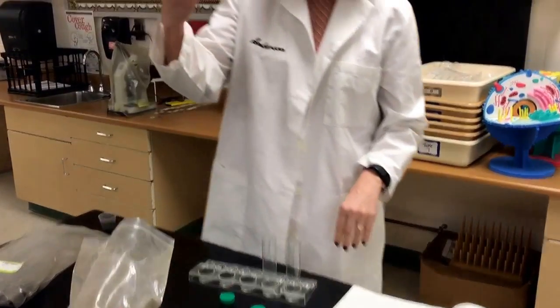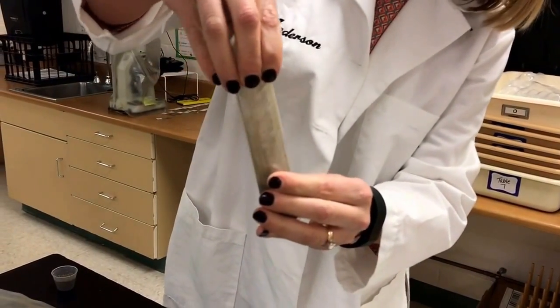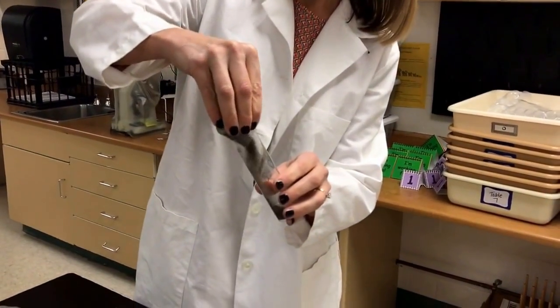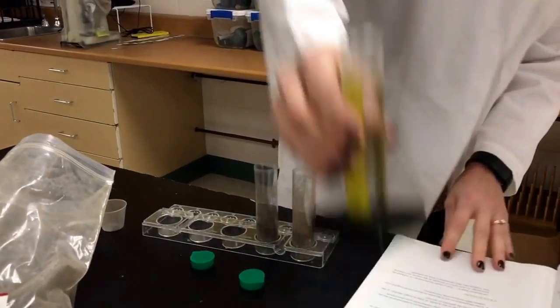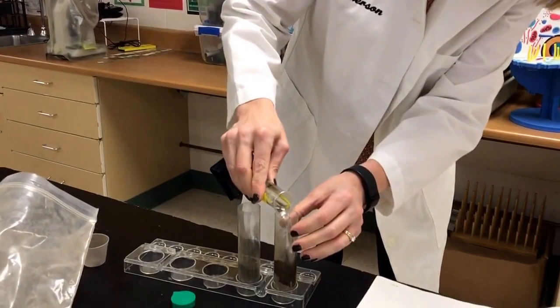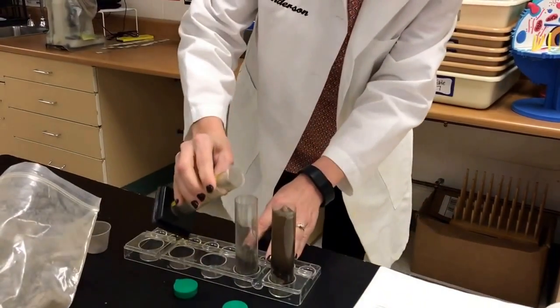So here we go with soil A. We're going to take about 20 milliliters of soil A and pour it into our graduated cylinder. We'll do the same with soil B, same amount, and pour it into our graduated cylinder. We're then going to take 50 milliliters of water, pour it in, and do the same with soil B.